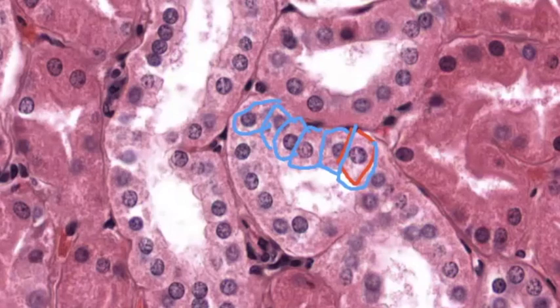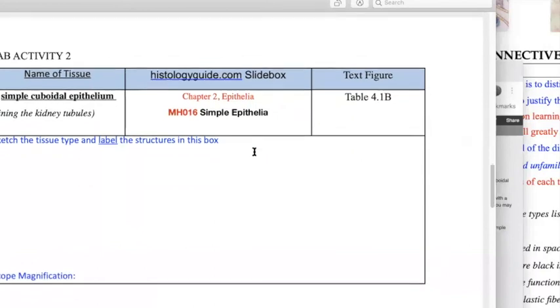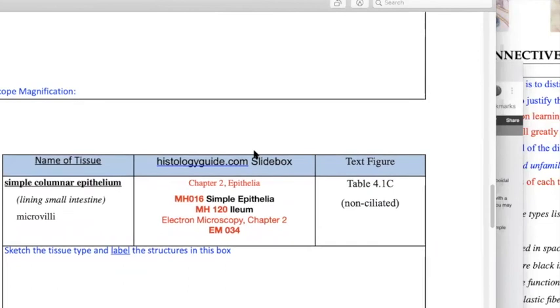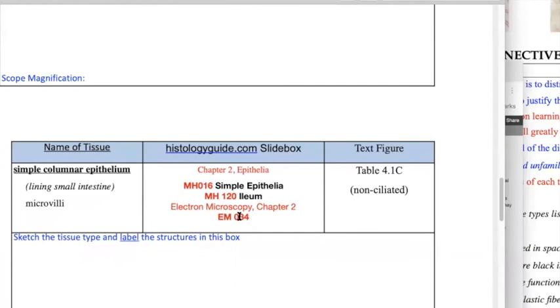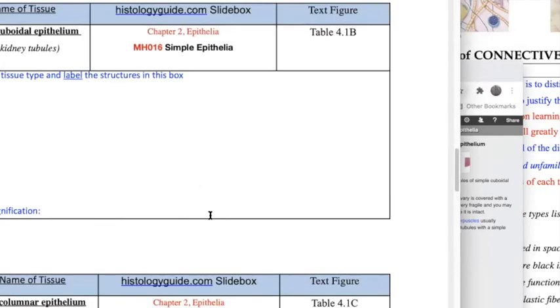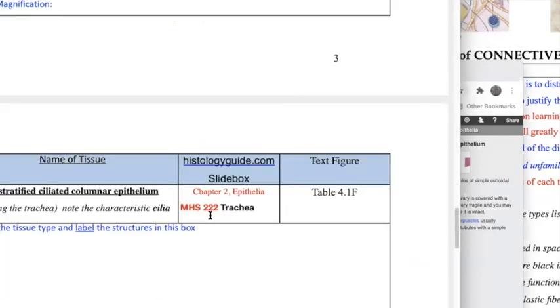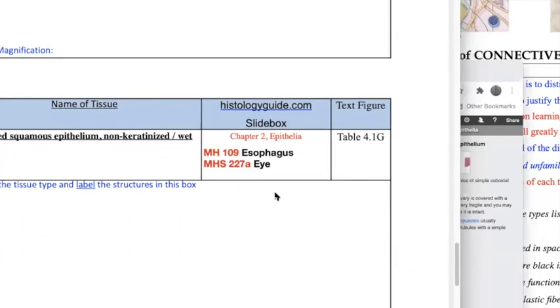All right, everybody kind of with me? Any questions so far on that? And you'll just follow that suit. I don't want to go all night here again. I know people get burned out, but that'll be the general program of how you want to go about these lab activities. And just try to find the slide that you're looking for, go over them, make your own tables. And some points I did start writing the tables in here. I got to fix just in the connective tissue one I didn't do. All right, so just go over all these samples right there.